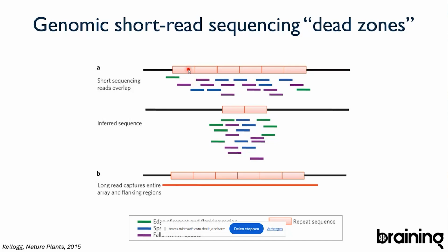What we can see at most from the bioinformatics will be 2 repeats, because we have some sequences that are inside the repeat. Okay, that's 1 repeat. And we will have some sequences that are on the verge of 2 repeats, on the junction of 2 repeats, which means that we know that there are at least 2 repeats together.